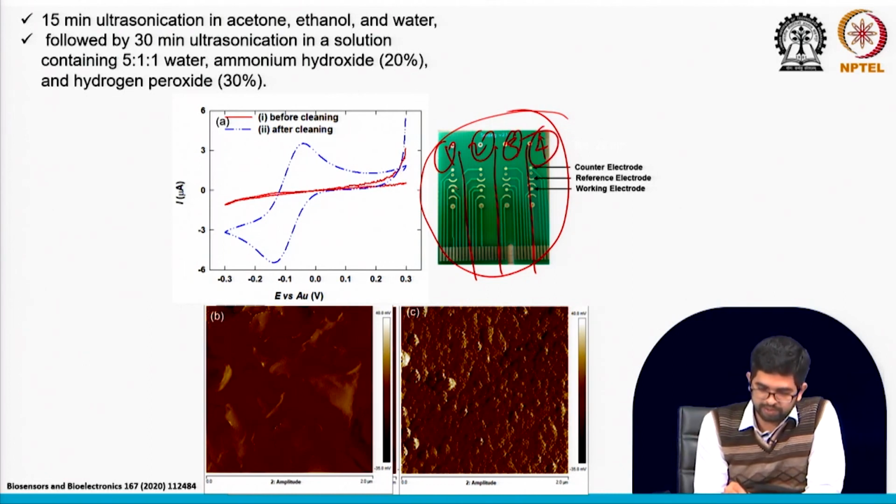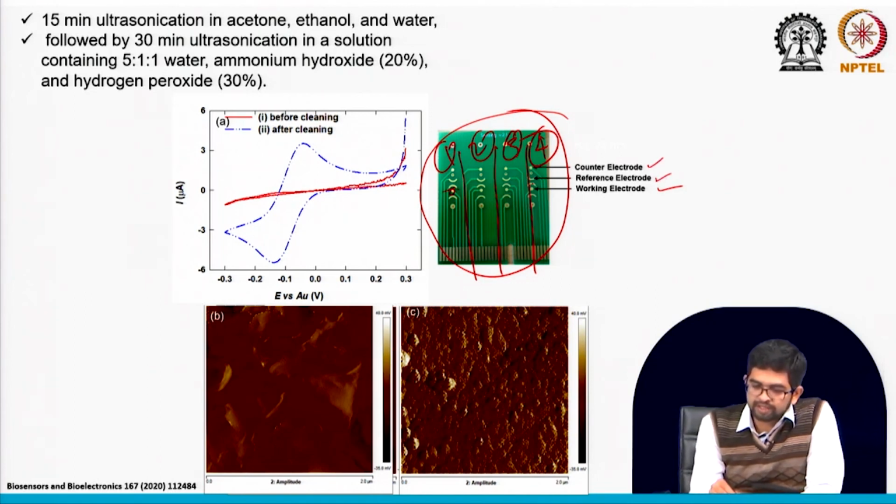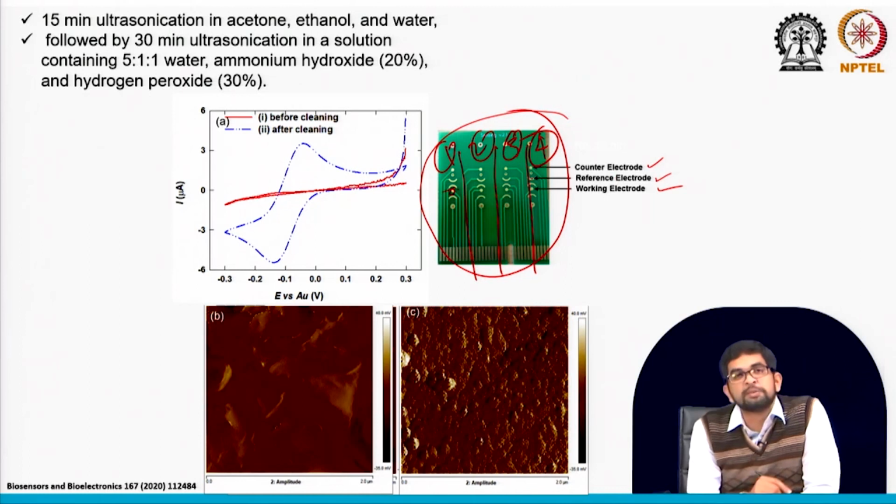So here maybe you can drop cast your antibodies, and one electrode, that is your working electrode. This is your working electrode, and this one you can use as the reference electrode, this one as a counter electrode. Actually here we are using gold as a reference electrode.